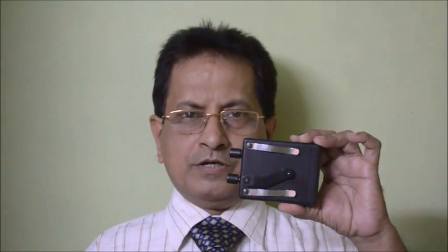Hi, my name is Romandrolal Mukherjee. I invented this instrument in the year 1998. The name of the instrument is micro microscope. There are two models: one is MM-01 and another is MM-02. This is the MM-01 model. It is a battery-operated device.